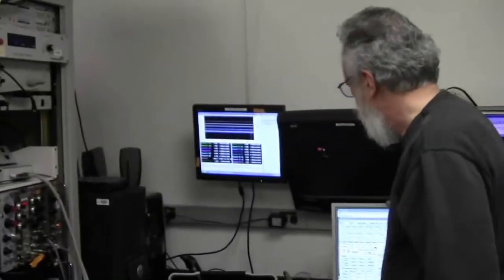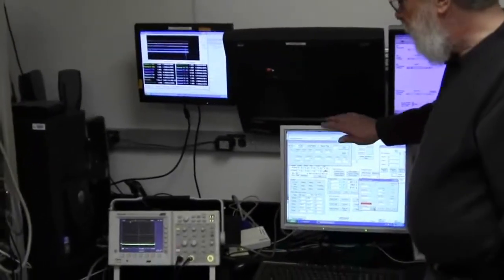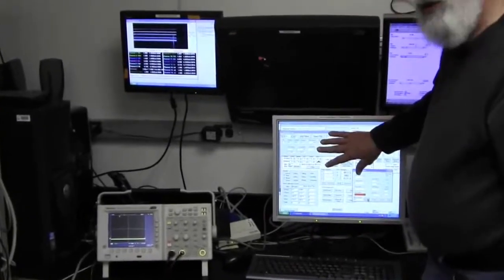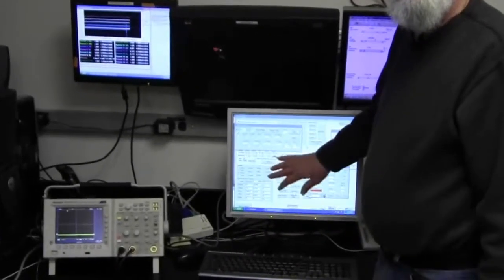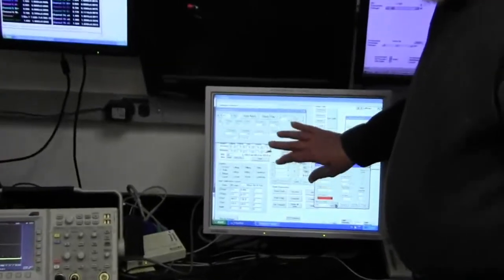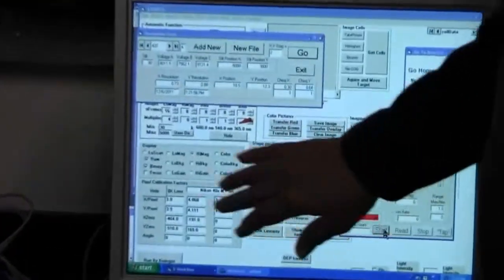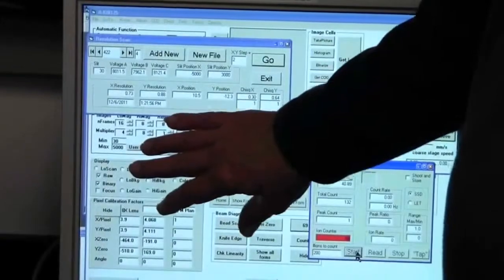We also have the control computer. This is the main control computer. We use this to control the number of counts we get, the position of the stage, the voltages on the lenses, and all of those features that we need to adjust are controlled from here.